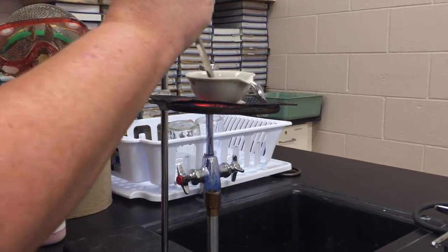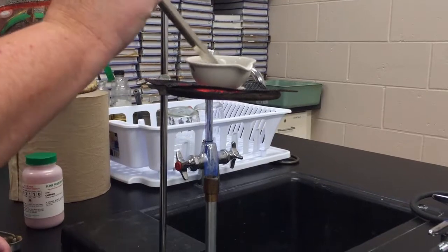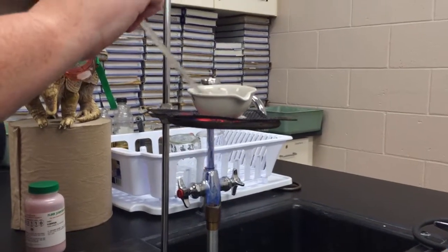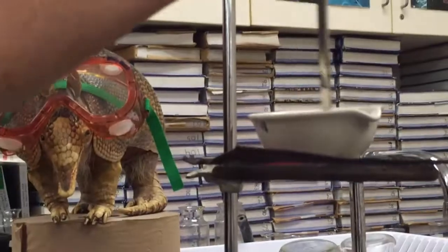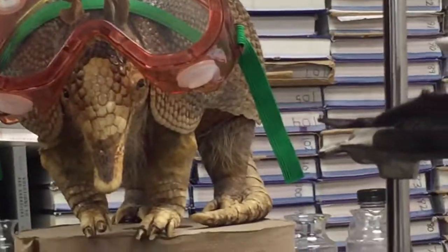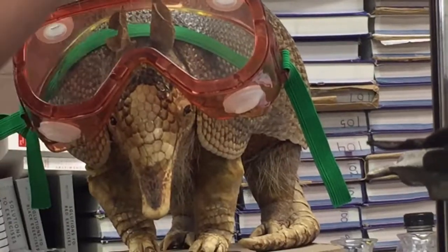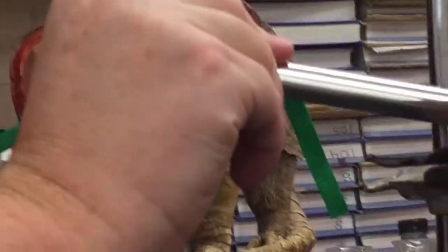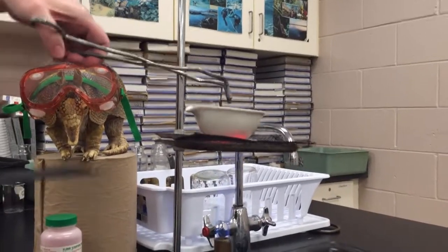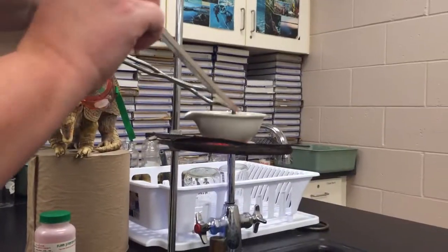So when you're making observations in a chemistry class, you want to get as much information as you can about the reaction, whether it's a physical reaction or a chemical reaction, in order to come to a conclusion. If it's just the copper changing color, then the mass should not be any different. If the mass increases, there would be an indication that something has been added.